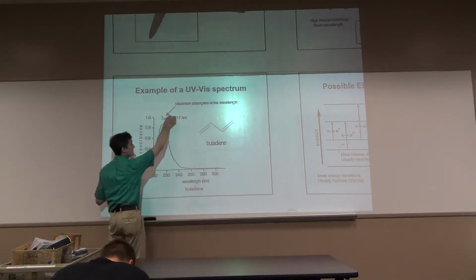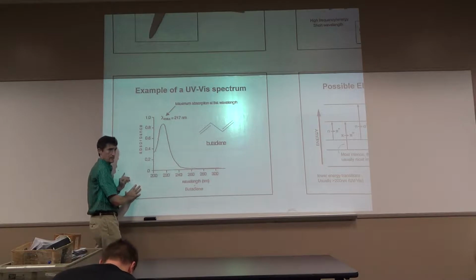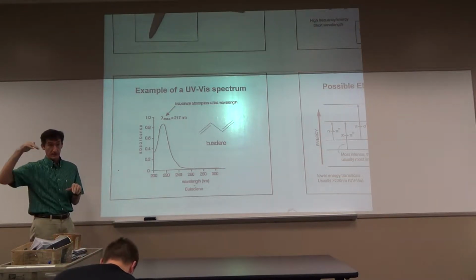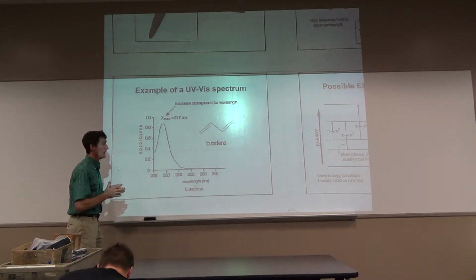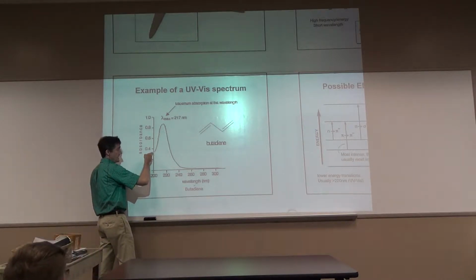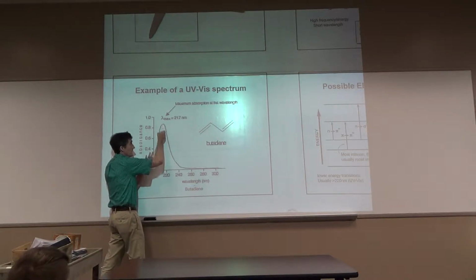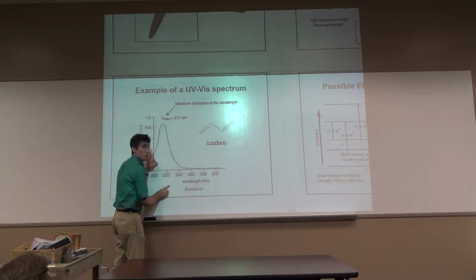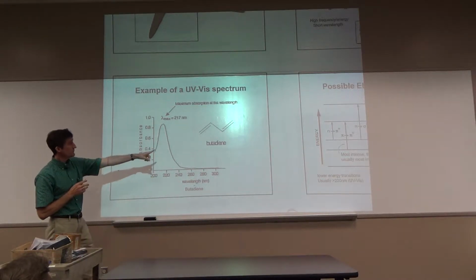With IR, the peaks come down. With UV, typically they go up. Kind of standard. Now, in IR, you get a whole bunch of peaks. Fingerprint, lots of peaks. UVVis, much simpler profile. We just have a scan here of the wavelength. And as you scan the wavelengths, we get absorbance. And then the absorbance tails off. And when we get over here to 260, it's no longer absorbing at all. This is a UVVis for butadiene.